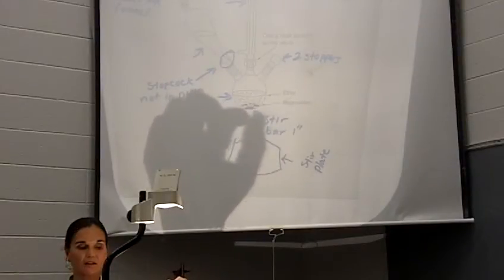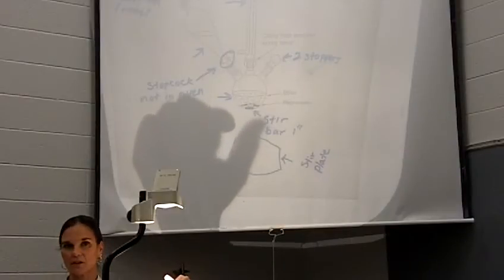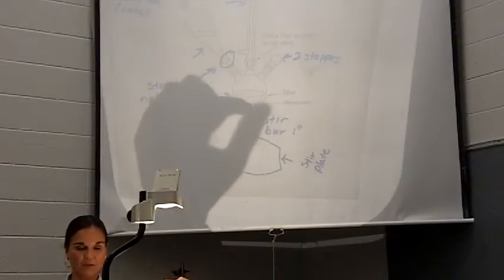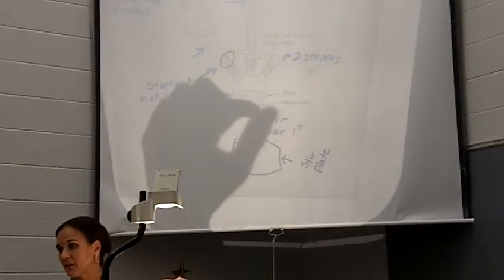You're going to start with magnesium down here, and so you're going to have to calculate. We're getting tricky on you guys now. We don't tell you how much magnesium. You have to calculate the amount of magnesium. So make sure you show that in your pre-lab. Certain amount of magnesium down here, okay? And you're going to have 10 milliliters of ether in here.